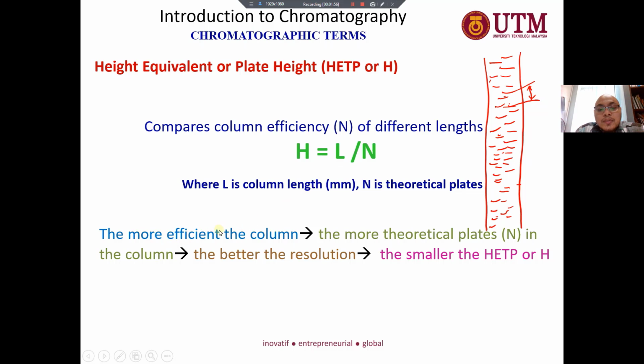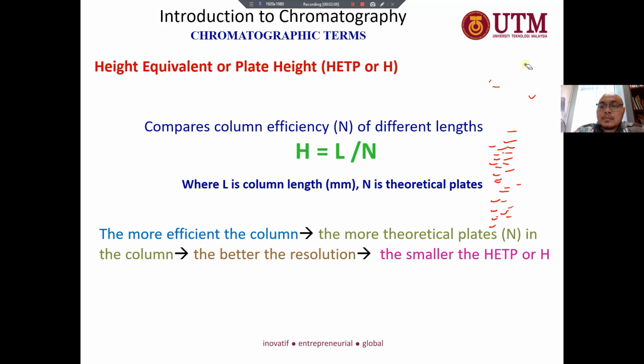Therefore, the more efficient the column, the more theoretical plates in the column, the better the resolution. Again, let's imagine, for example, you have two kinds of column.